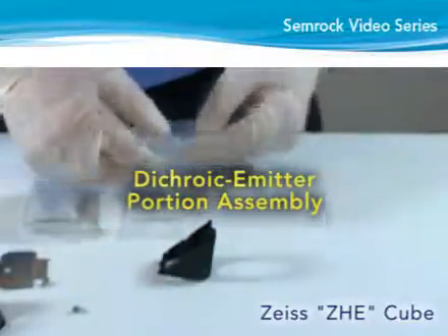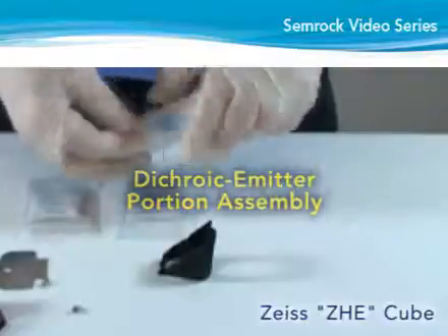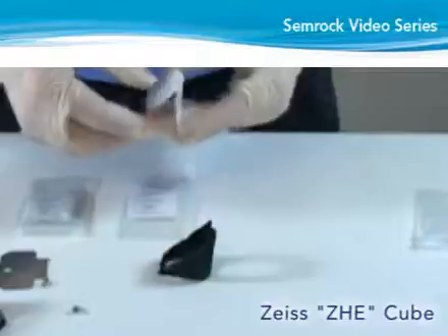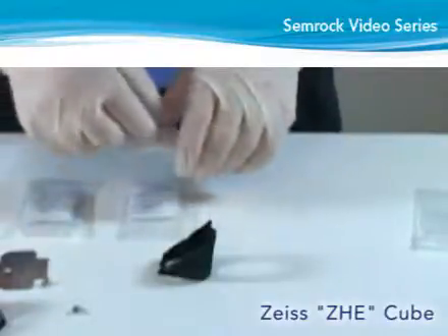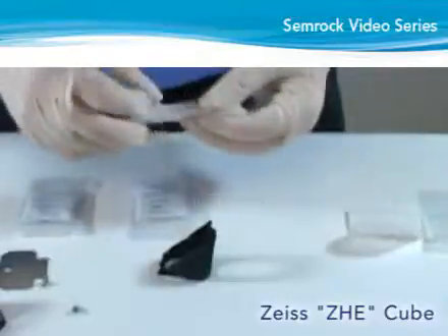Assemble the dichroic emitter portion of the cube first. To do so, hold the emitter half of the cube — that is, the half with the two prongs at one end and without the large side flanges used to mount the cube in the microscope.